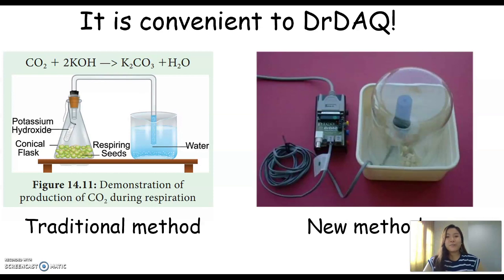Okay, so this comparison shows that the usage of a data logger really makes things easy for us to conduct experiments, especially in this respiration experiment.